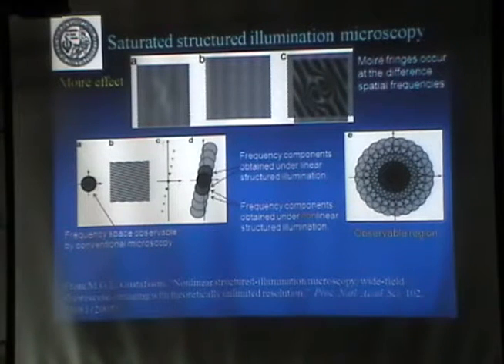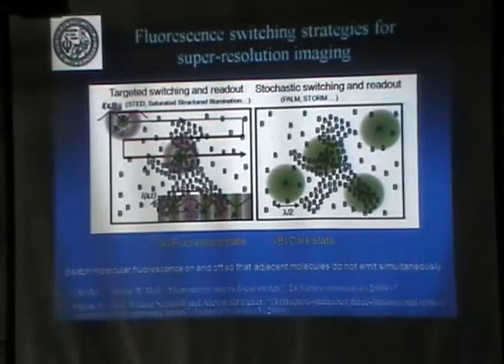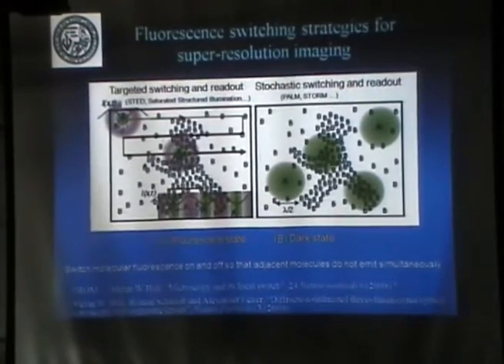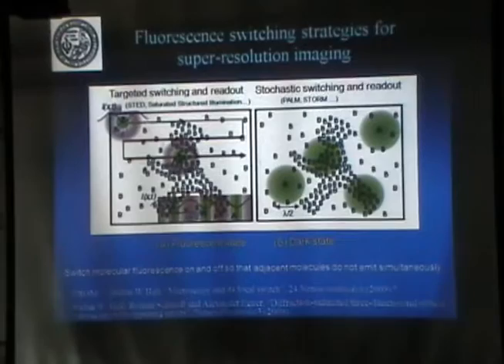So we saw 3 methods in fluorescent microscopy that can achieve super resolution. And they are essentially all based on the same principle. The principle is that you are using some non-linear effect, because we said linear optics is not going to make it. And in all of them, you are switching some property of the material. Okay?